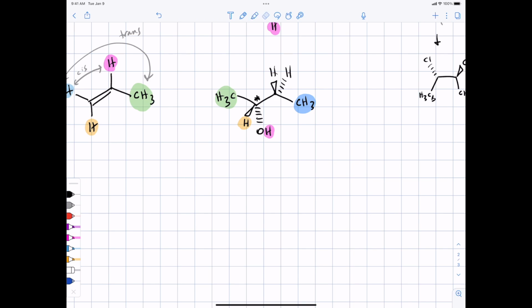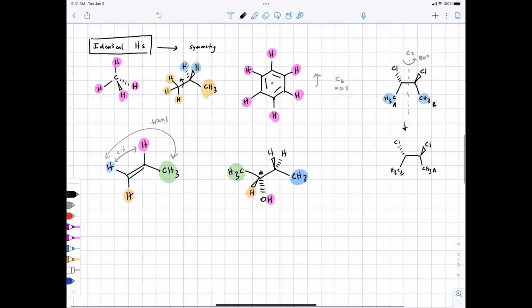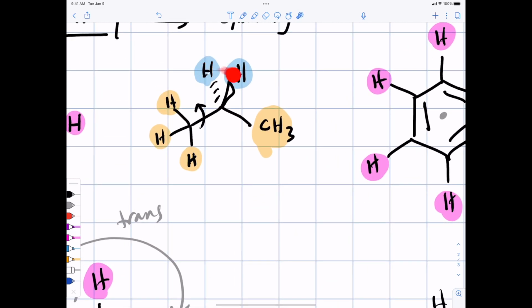How about the two protons adjacent to the stereocenter? This is a very difficult thing for students to see. You're used to thinking of CH2 protons as being identical, but remember, the reason these two protons were identical was because you could exchange them via an operation of symmetry, whether that was a rotational axis or a mirror plane.